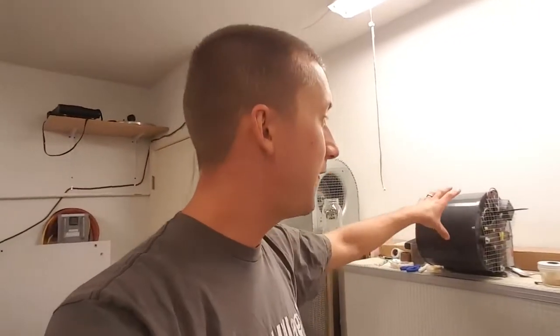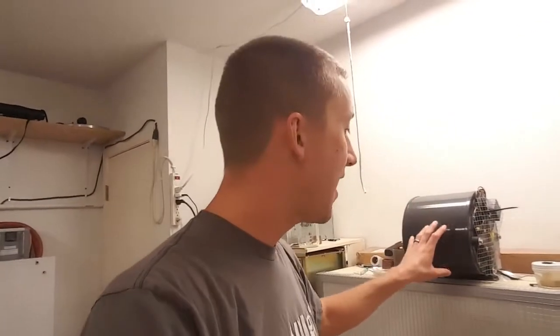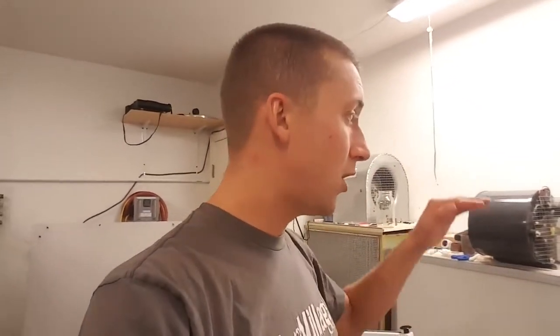Getting into fan and filter matching: the main thing is to make sure your fan is big enough for your filter, and you want to look at the resistance of your filter. I bought a Dayton blower — I forget the model number, it's about $200 — and for this hood shooting around 100 FPM, I went a little high because filters clog up over time and you'll end up on the low side. So always shoot a little high on your initial flow numbers.